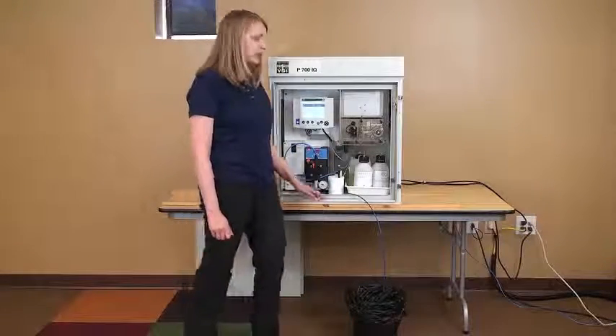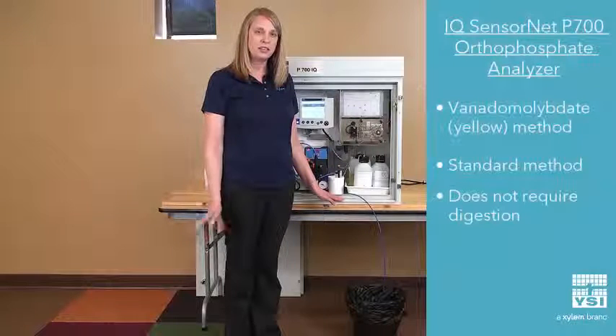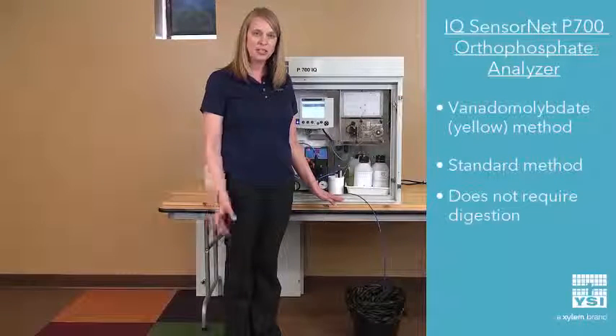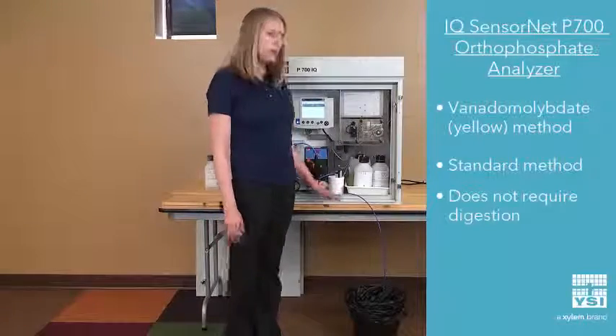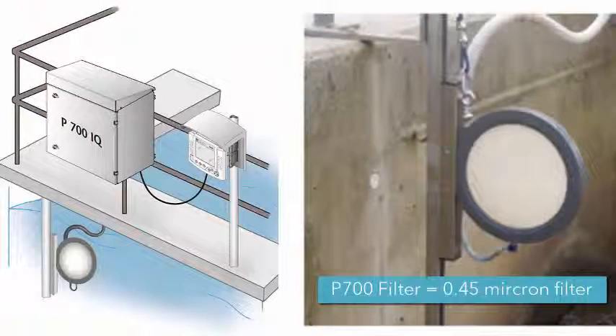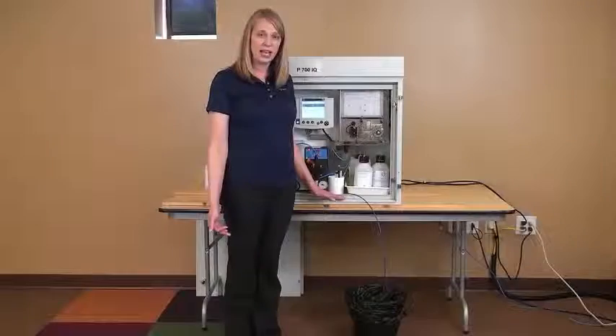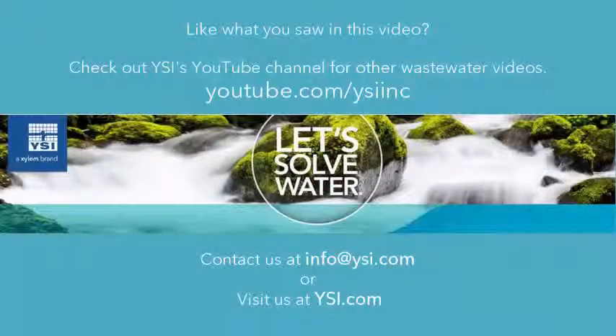The analyzer itself uses the vanadate molybdate method out of standard methods. It's also referred to as the yellow method, so it requires no digestion. In addition, the standard method requires a 0.45 micron filter, which we offer as an accessory, ensuring that the measurements you get from this analyzer are compliant with your lab.